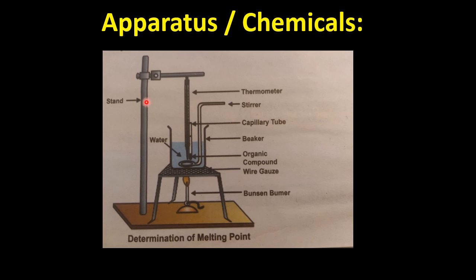Why do we need this iron stand? To hang and clamp the thermometer. We need a thermometer to measure the temperature or heat. After that, we need a capillary tube, which is a small glass tube. The thermometer and capillary tube should be bound together with thread at the base level. They both should be on the same level.